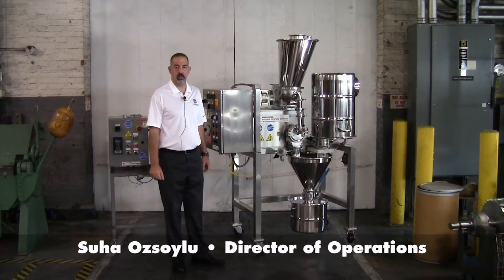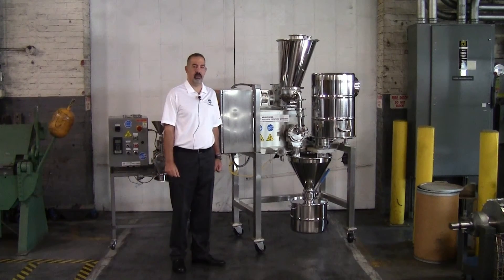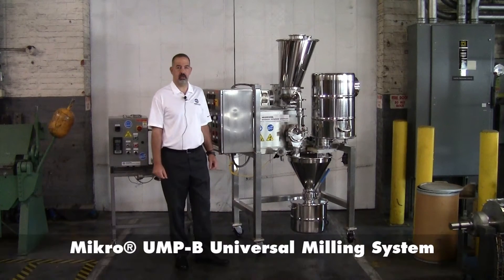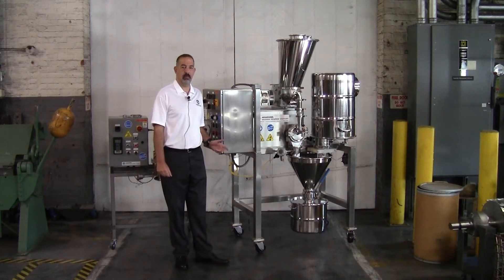Hi, my name is Suha Osoilu. I'm the Director of Operations at Hosokawa Micron Powder Systems, and today I'd like to introduce to you a special version of our Universal Micro-Pulverizer UMP Model B.